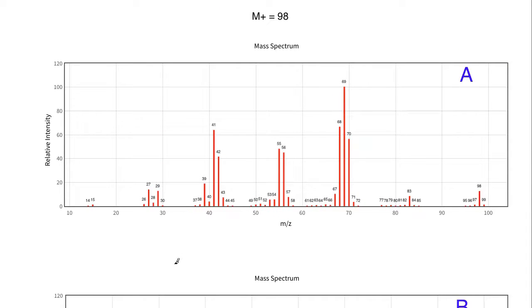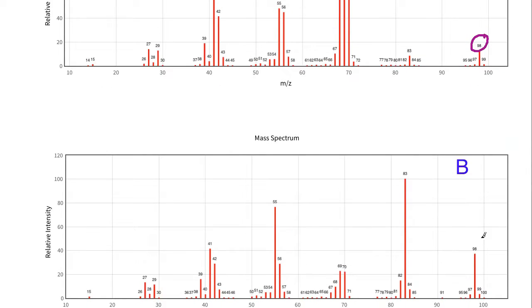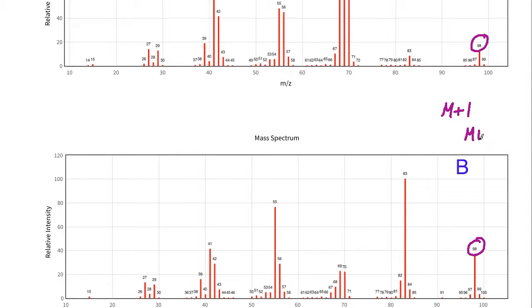We'll determine based on the base peak relative to the M+ peak. To start, the M+ peak is going to be 98, this one right here. You may notice there is a peak at 99, and in this one down here there's one at 100. That's what's known as the M+1 and M+2 peaks.